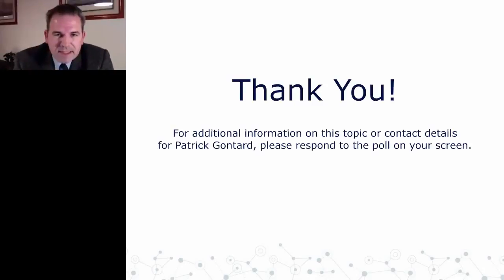This is a tricky question, and I think it would take more than a few minutes to answer. Nevertheless, informatics: the first thing we do in all the labs we work in is to do an assessment of the ecosystems of systems that we have deployed, and how to collect data from it, and how to objectivize the data that is collected. This is the first step.